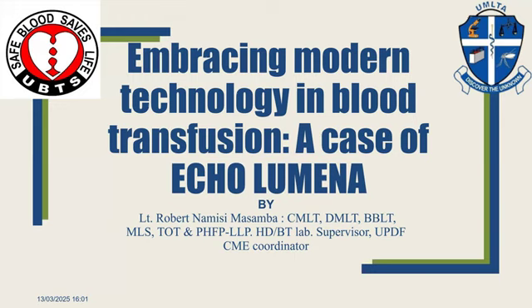Secondly, he talked of validation. The method I'm going to talk about, you can't run samples without running controls. So that is also a big issue, which we shall see in the methods as we go through.